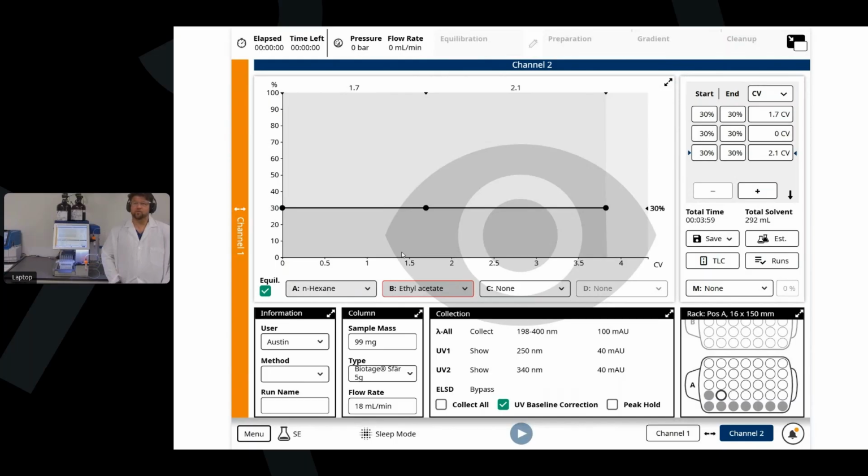We typically recommend, and I can't remember off the top of my head, Simone, you probably have a better answer for this. Again, as concentrated as you can, and I think no more than, is it 1 to 2%, Simone, for peptides? 3% or less. 3% of the column volume of the system. So we try to stay below that from a DMSO volume capacity perspective.